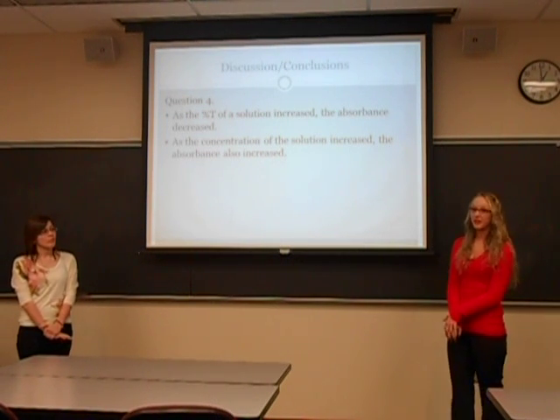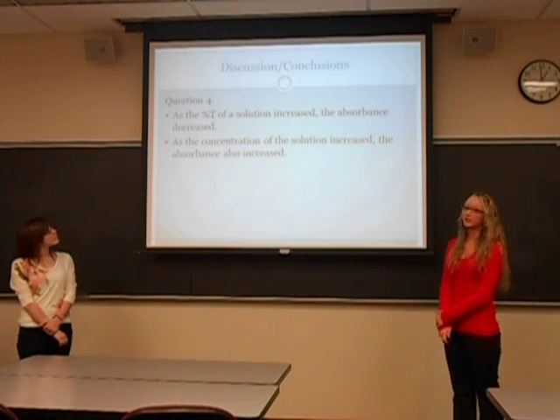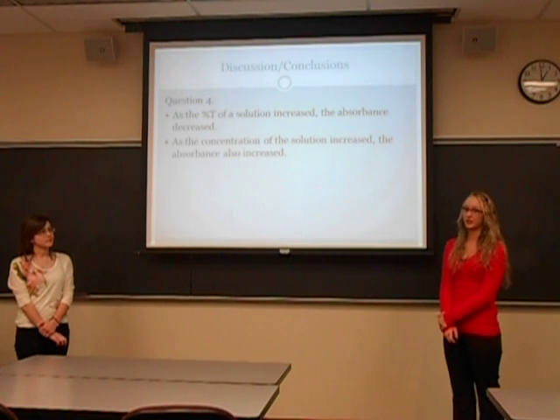For question number 4, we figured that the trends were as percent transmittance of a solution increased, the absorbance decreased, and also as the concentration of the solution increased, absorbance also increased.